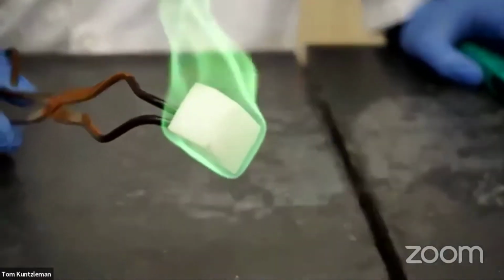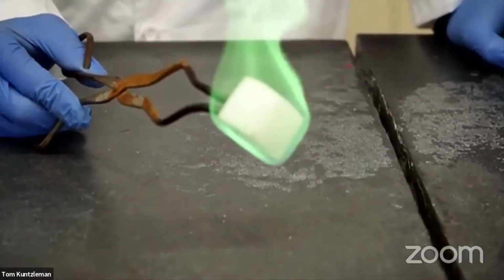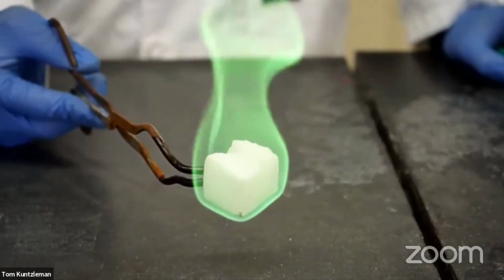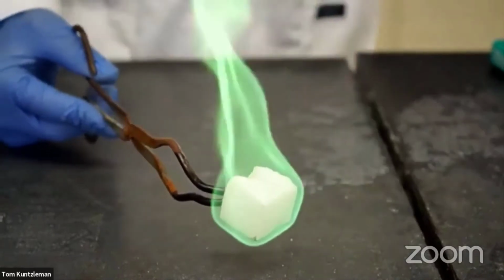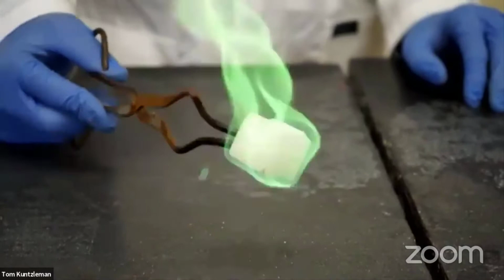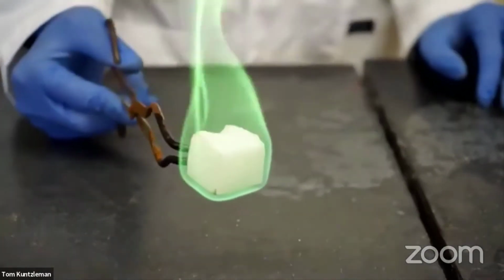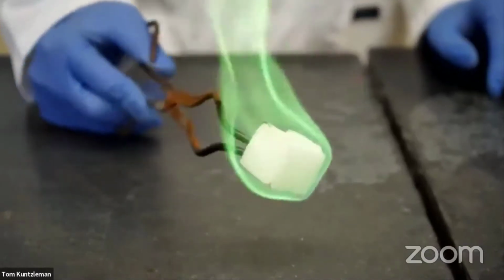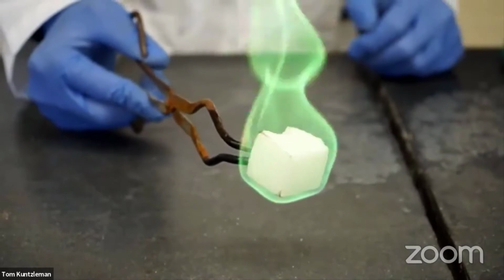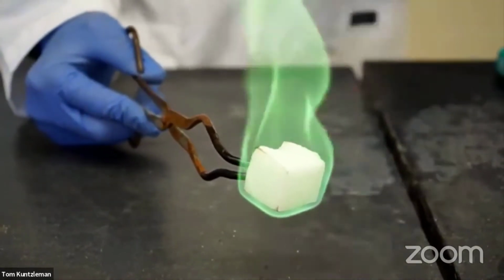You know, I think that this is a nice color for the Michigan State University Science Festival, don't you? Yeah, copper is sort of like a perfect element to study for the Michigan State Science Festival. Look at that green color, and it's on a white sponge to boot. Go green, go white, they say. Isn't that right? Beautiful.